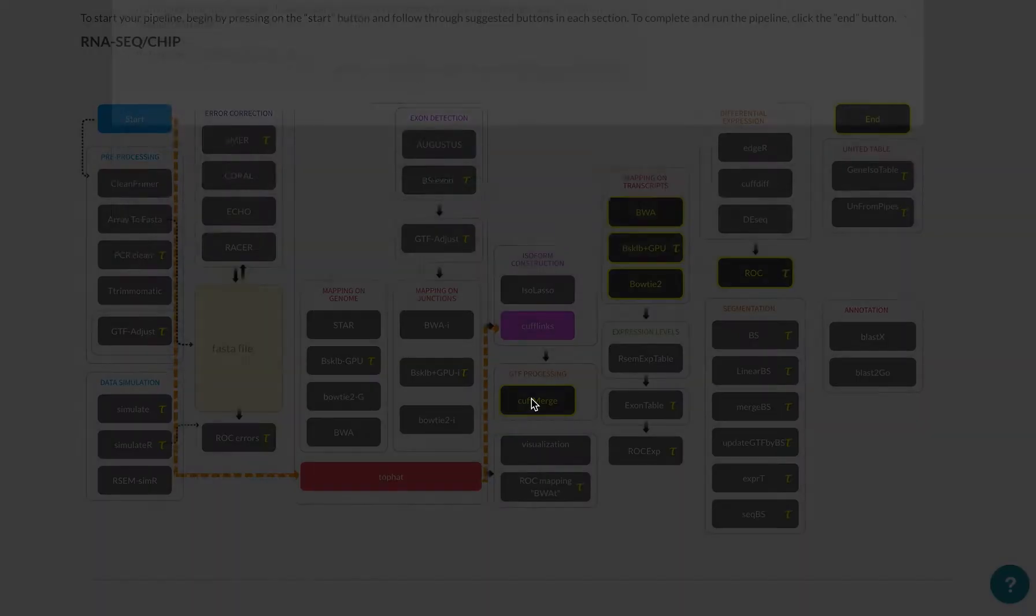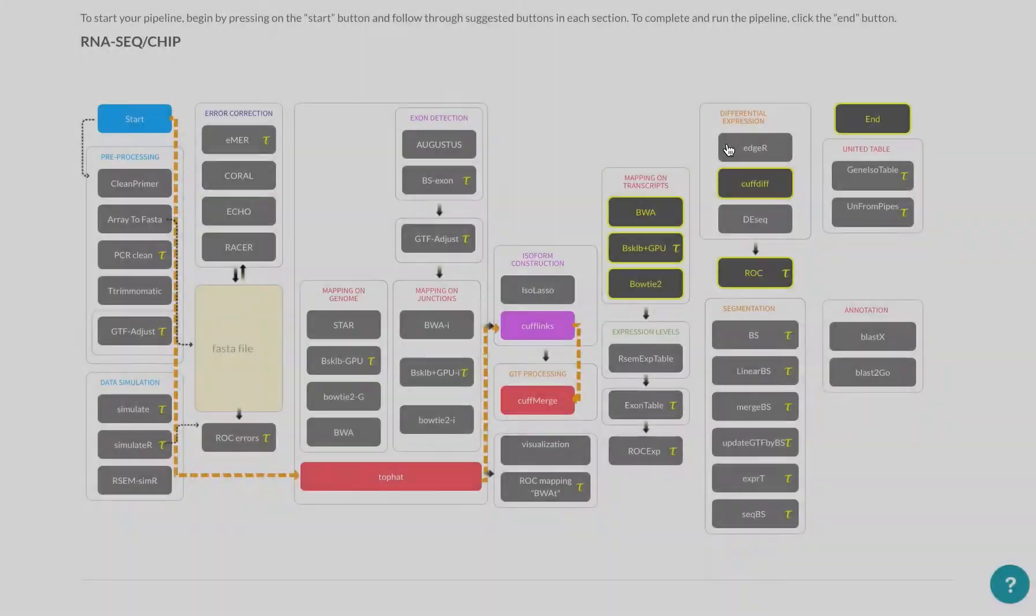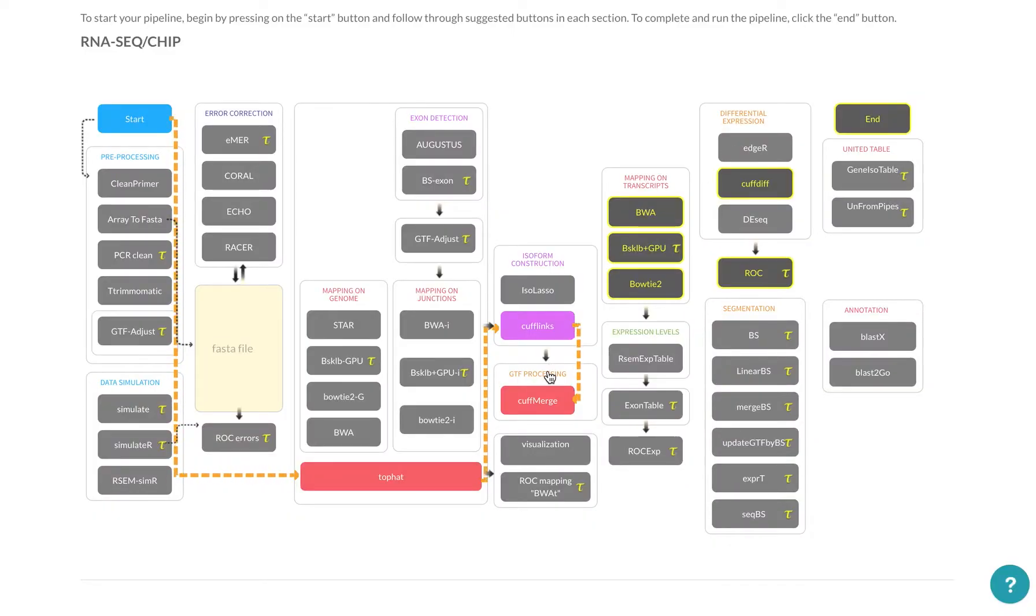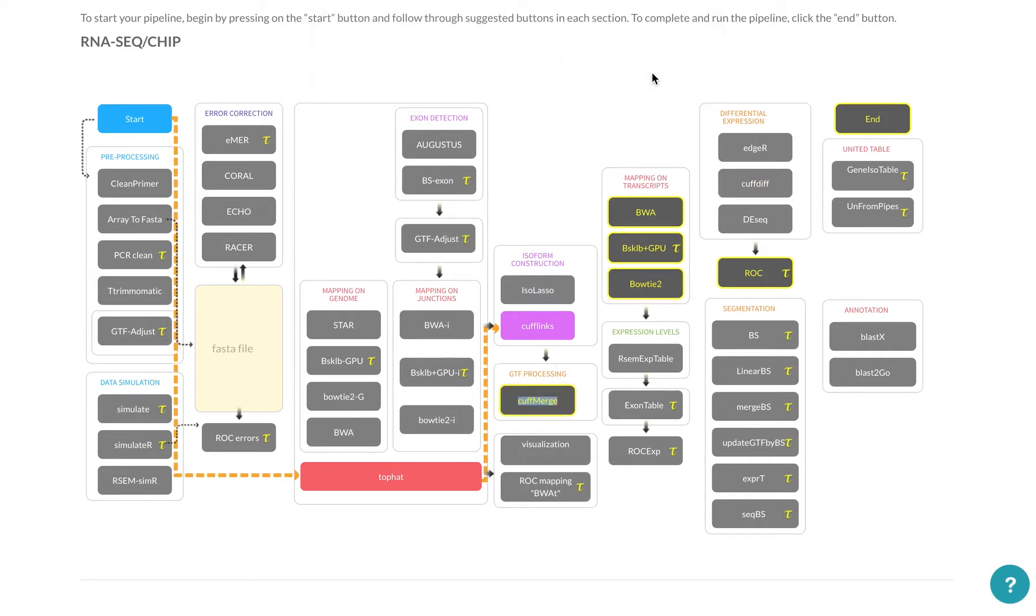Now if you made a mistake and you want to go back, you just right click on that button. And that will allow you to jump to the previous step. So you can see I deselected this, so you can select it again.